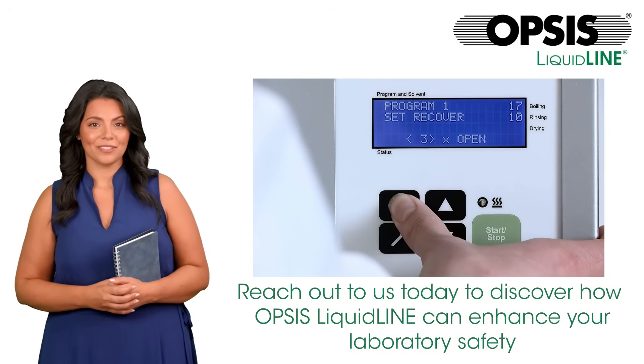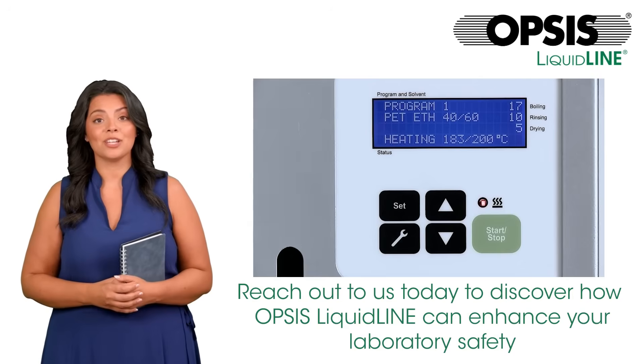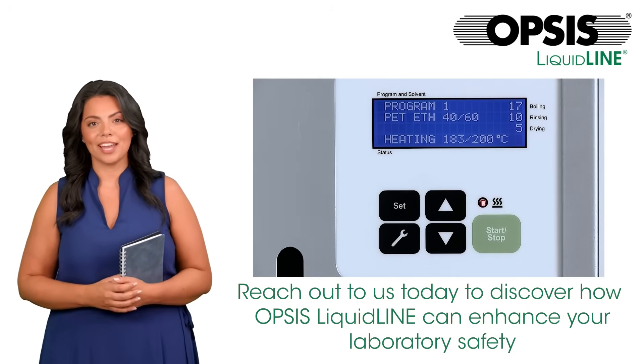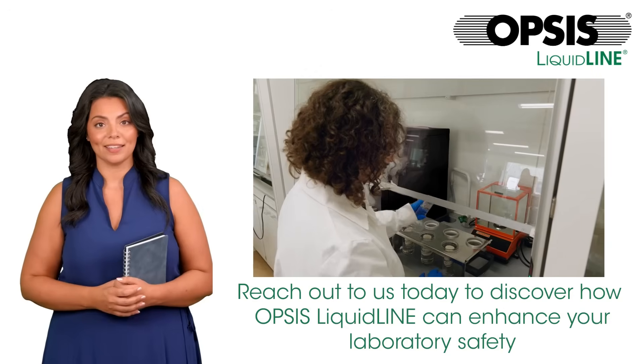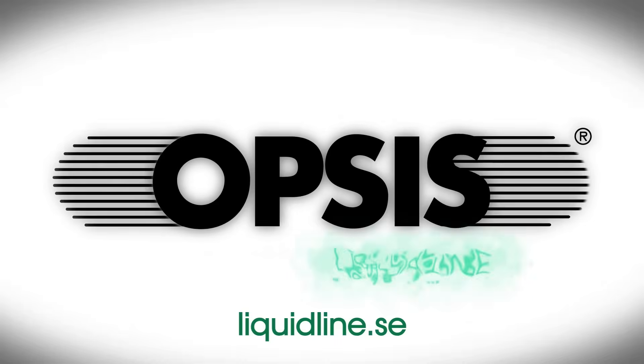As demonstrated, the SOXROC is a safe instrument, designed with care to ensure reliability for your hot solvent extractions. Reach out to us today to discover how Opsis LiquidLine can enhance your laboratory safety.